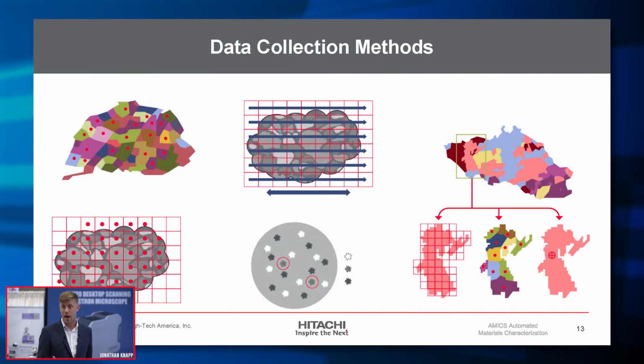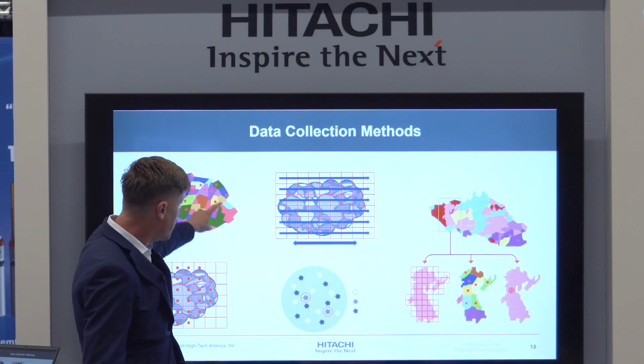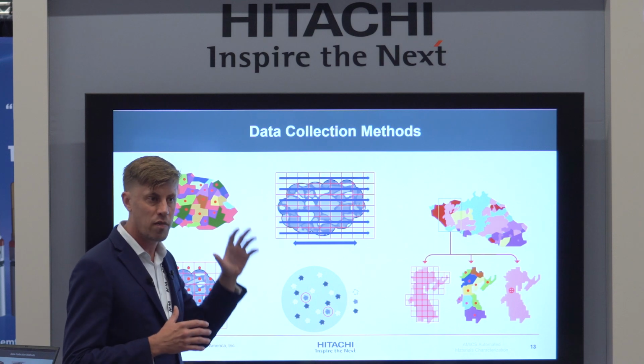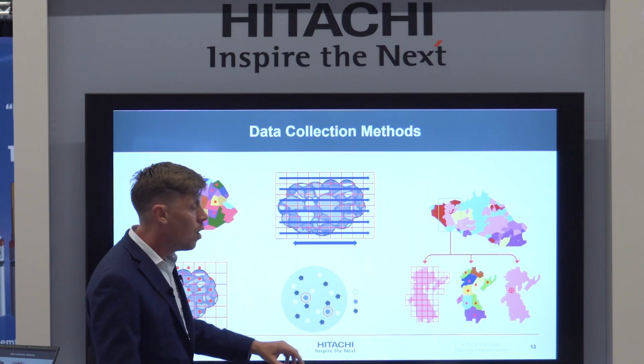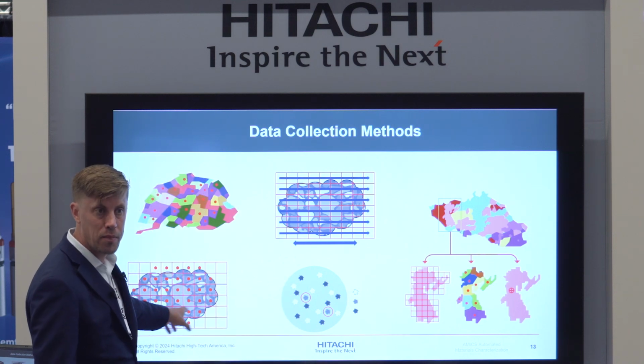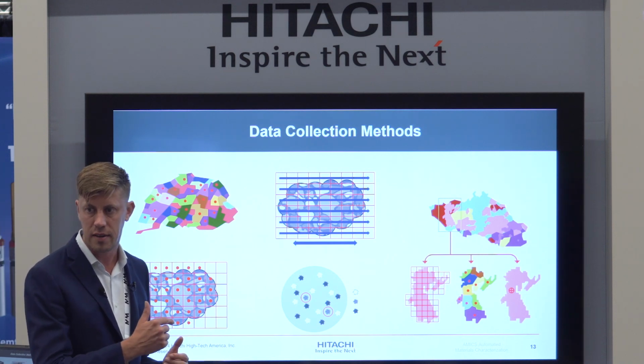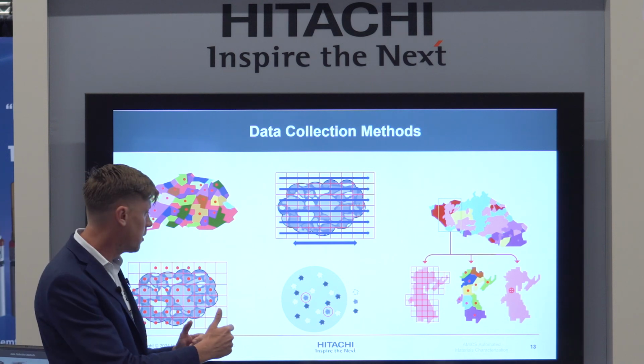But we have many mapping modes. Forgive my cartoon. I'm going to make a better cartoon, but it's just in process. So we have segmentation mapping mode, which I'm just going to walk over here. We have the segmentation mapping mode. We have hypermap mapping mode, which is going to be over the entire system. We have matrix mapping mode, which subtracts the background and then puts points at a user-specified spacing.